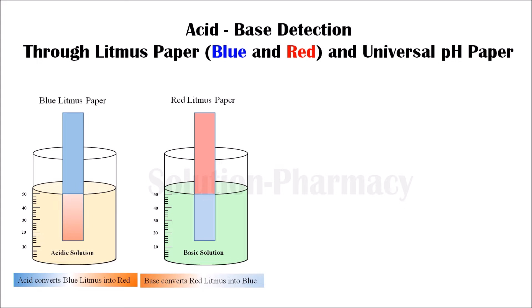So by this experiment we conclude that acidic solution converts blue litmus paper to red, and basic solution converts red litmus to blue. However, by this experiment we can only know whether our solution is acidic or basic in nature, but not how much acidic or basic it is.